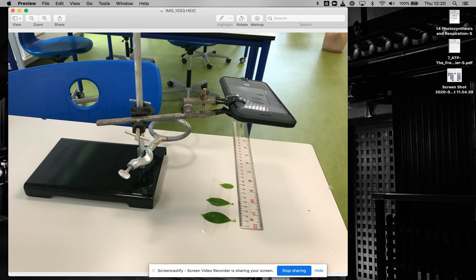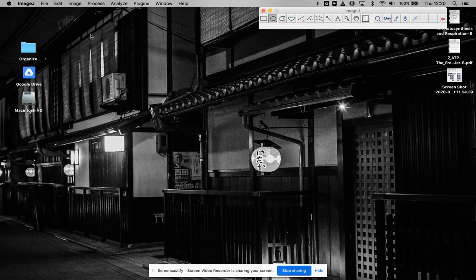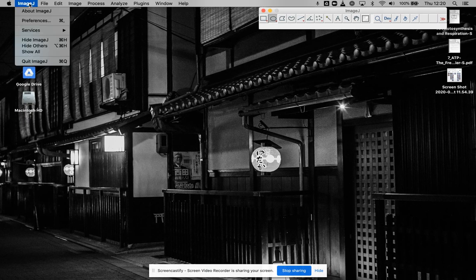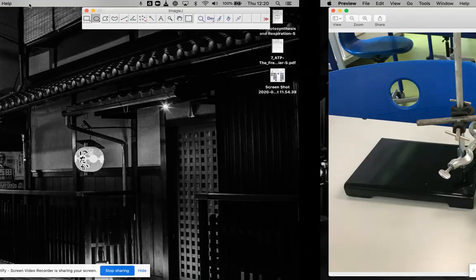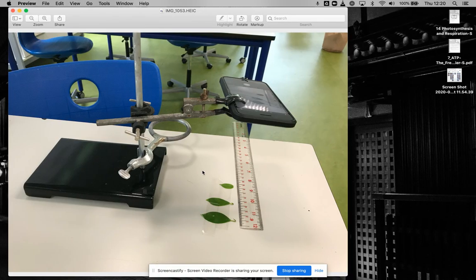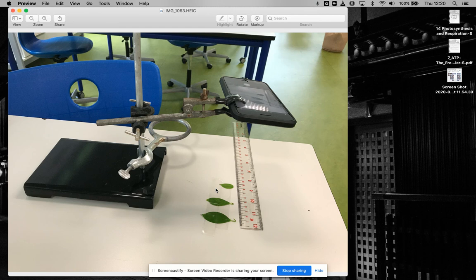In this video, I'm going to show you how to use ImageJ to measure area, length, and a whole bunch of other things for any of your IAs.